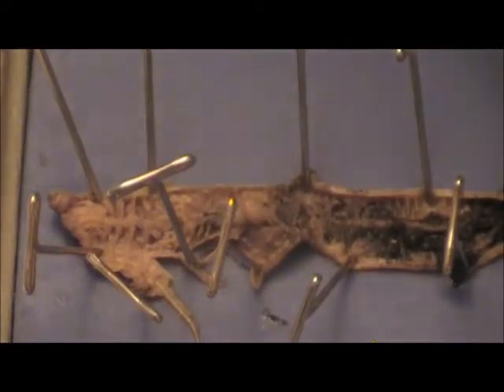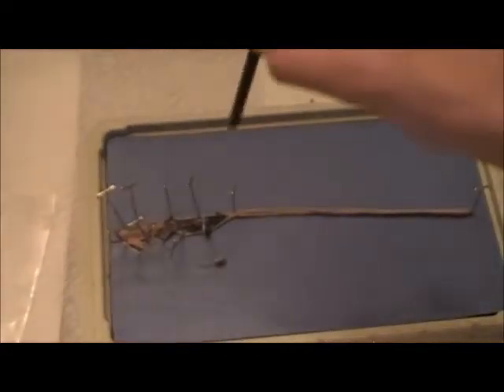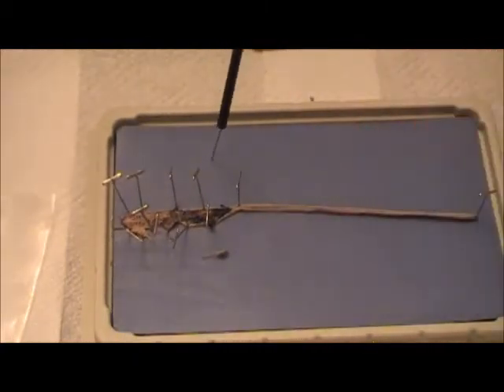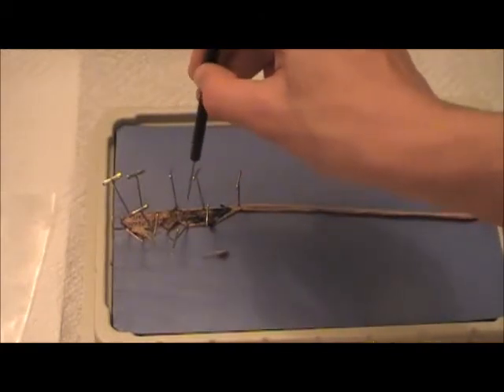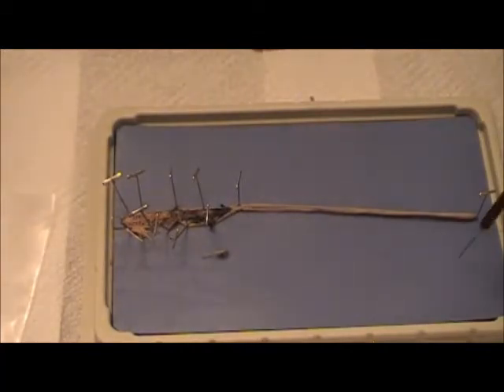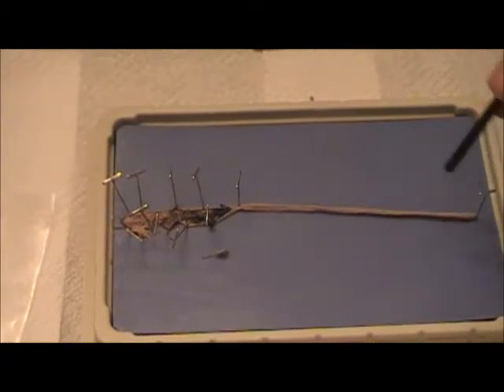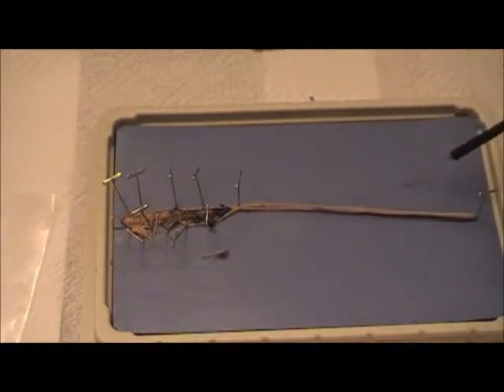So basically, from the beginning, let me zoom out. From the beginning of the digestive tract, which is right here, right after the gizzard, it has the most nutrients, and then it has the least as it comes out the anus. So it has all that surface area and time and length to digest the nutrients out of the food.